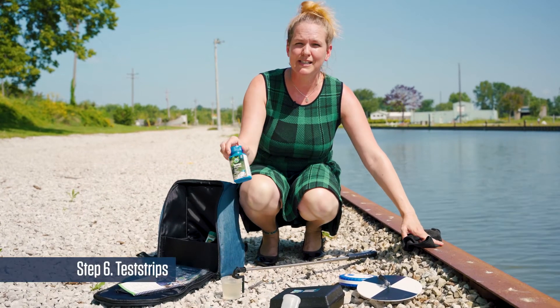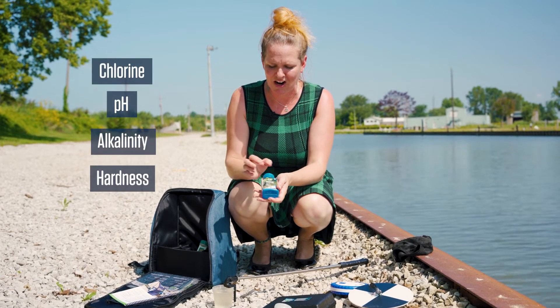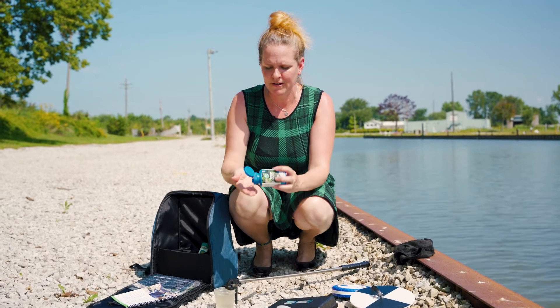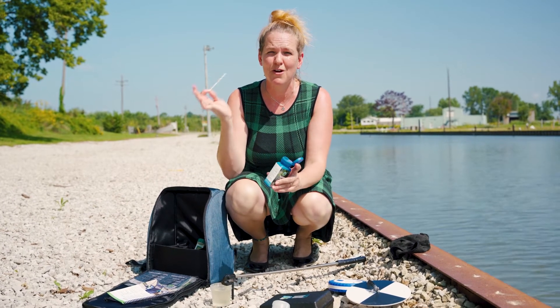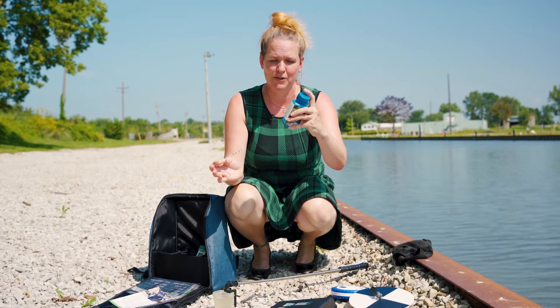Next, we're going to use our test strips, which measure chlorine, pH, alkalinity, and hardness. You're going to compare the colors on the back of the container. Open up your container and shake one out. It's very important that you have dry hands for this — any moisture that gets into the container is going to ruin the rest of the strips.